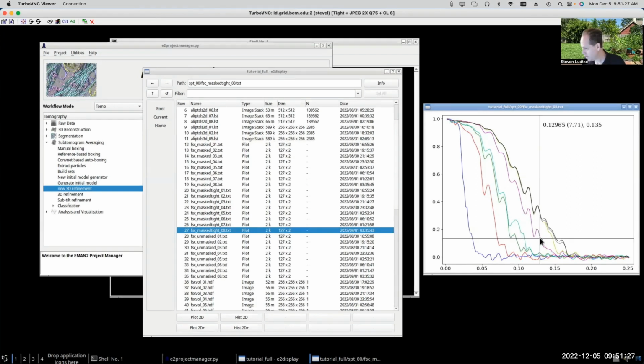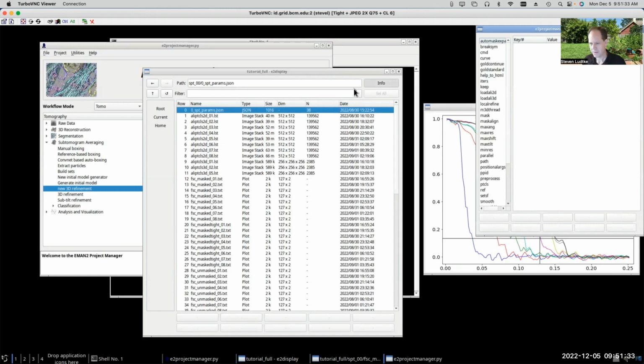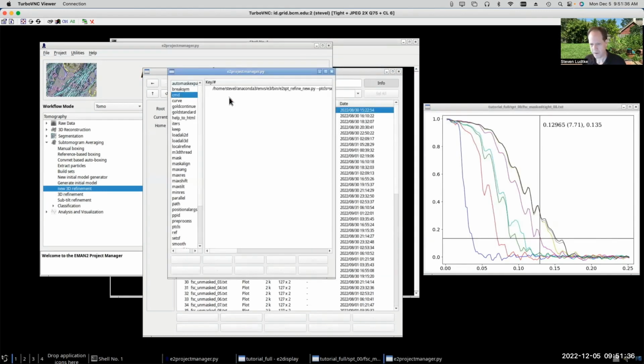And then another iteration. So then, hang on, let's take a look at the options again. I don't even remember what they were. Okay, so we had 3D, 3D, 2D, 2D. There we go. 3D. So you can see we did get some improvement out of the 3D alignment after the 2D alignment. Then another 2D alignment. After doing the 3D alignment, doing the 2D alignment again made another significant jump, and that took us to about 7 angstrom resolution, 6.8.